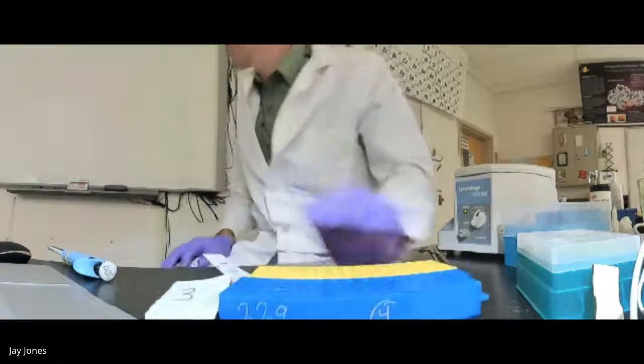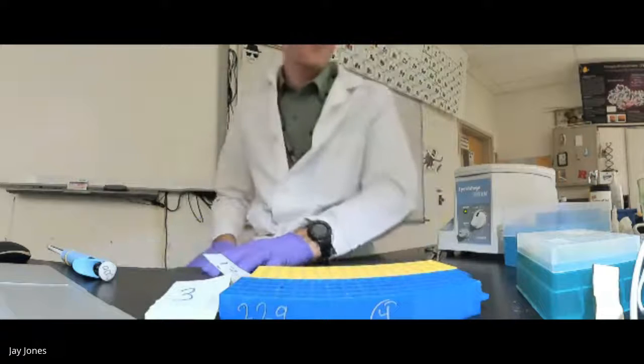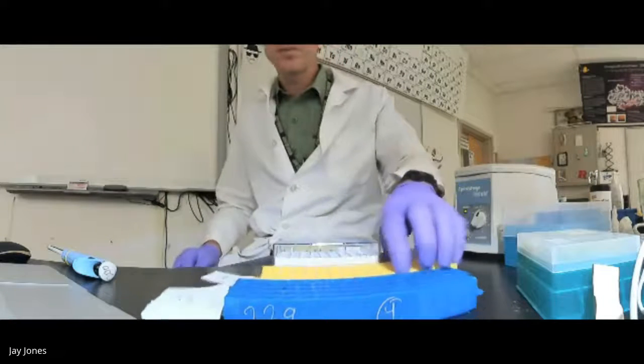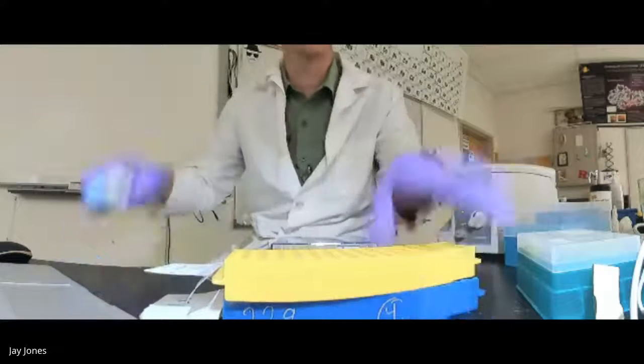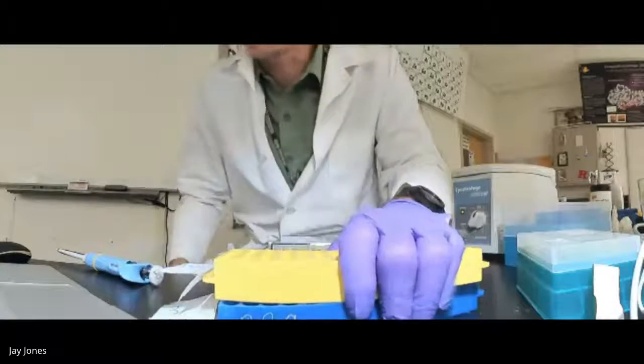Almost done. We'll know in a minute. I'll know I did this correctly if I see 60 microliters of liquid in the yellow tube. It should be correct.